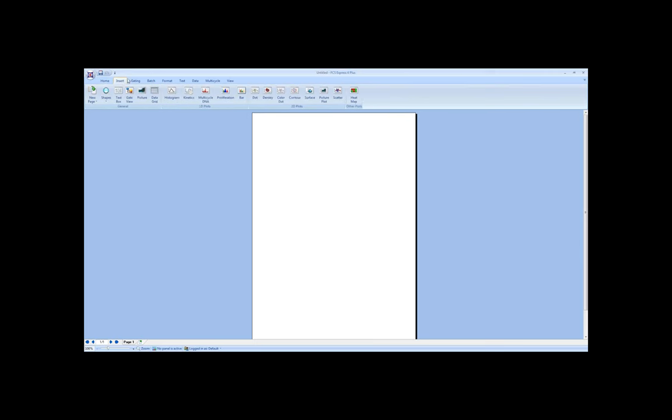We can come up here to our tab and ribbon interface. This is going to act just like Microsoft Office. And just like PowerPoint, we have an Insert tab. Now, in PowerPoint, you're going to be inserting things like shapes, like text boxes, like pictures. But in FCS Express, we want to insert things as well, things like histograms, dot plots, density plots, color dot plots, different ways to visualize your image cytometry data.